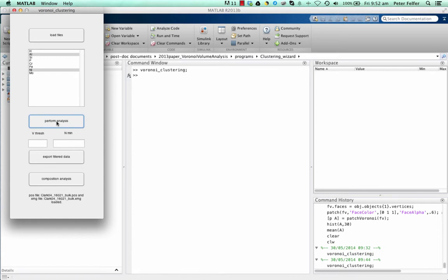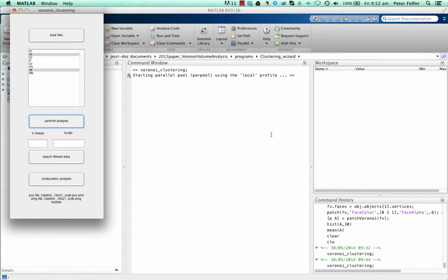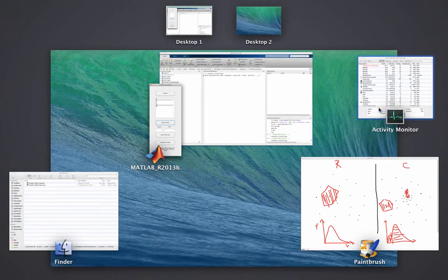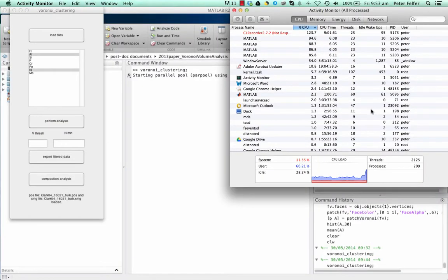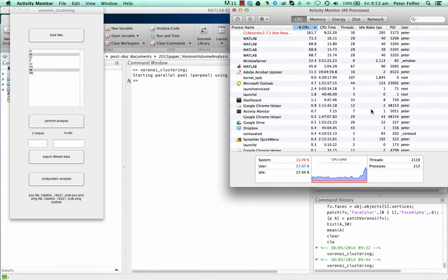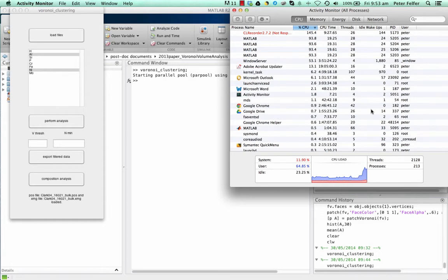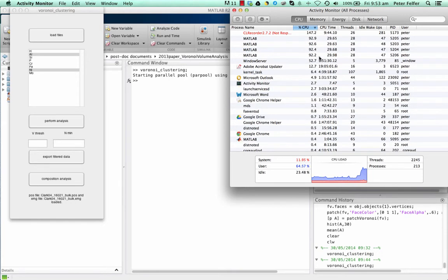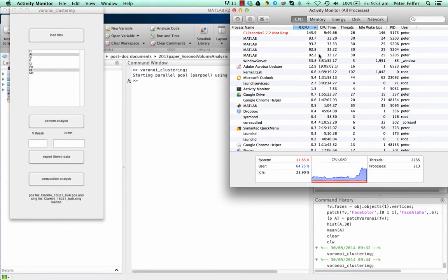The programs are actually parallelized. One of the first things it will do is try to set up multi-core processing on your computer, which, depending on whether you have that set up in your MATLAB or not, will either happen or not happen. You can see here, it lights up that we're running on four cores. We'll start the processing. Unfortunately, I got rid of the progress bar, because there was some issues with the progress bar on different systems. It will run a little bit slower than usual, because I'm running the recording software. As you can see, MATLAB is happily working away on four cores and performing the analysis.